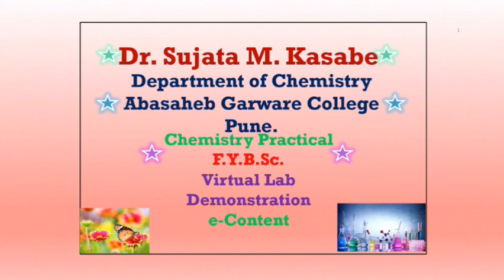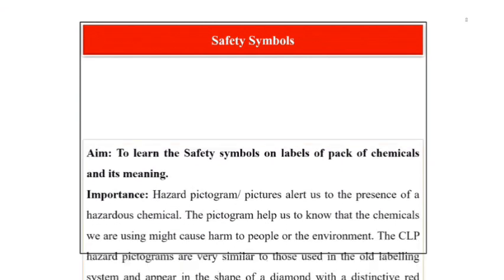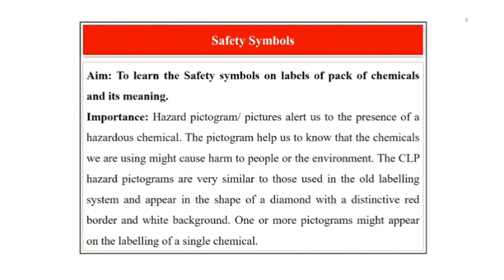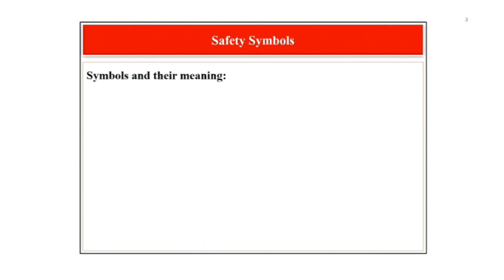The aim of this experiment is to learn the safety symbols on labels of packs of chemicals and their meaning and importance. Hazard pictograms alert us to the presence of a hazardous chemical and help us know that the chemicals we are using might cause harm to people or the environment. The CLP hazard pictograms appear in the shape of a diamond with a distinctive red border and white background. One or more pictograms might appear on the labelling of a single chemical. Let us see some symbols and their meaning.